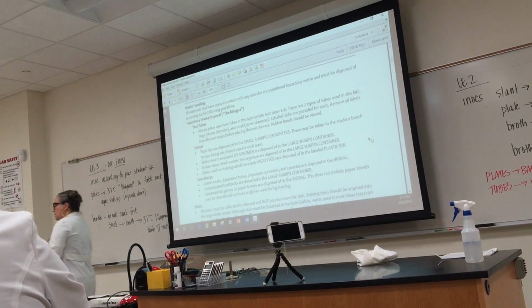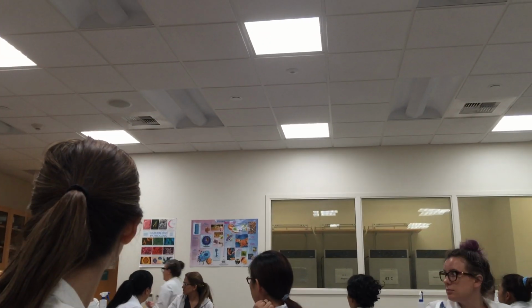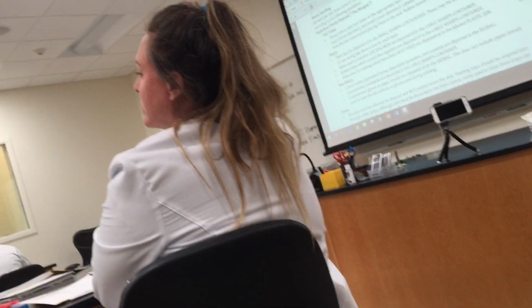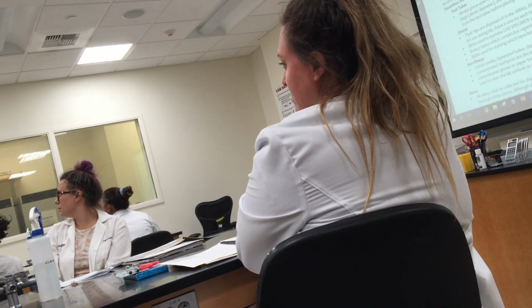So you'll take the stickers off, you'll walk over to the morgue, and everything is really labeled, so if you're ever wondering where something goes, it's labeled. We have small test tubes. What you're working with today are all small test tubes. So you'll take the labels off, put them right here, and then this will get autoclaved. Emily will come in after class, wheel this into the room, and sterilize those things before they go into the trash, right? So we don't send live organisms into the trash.